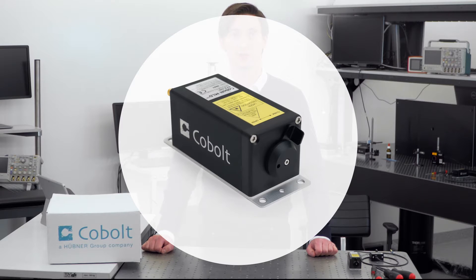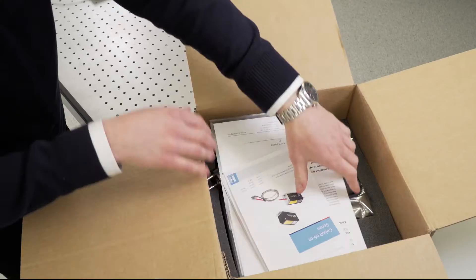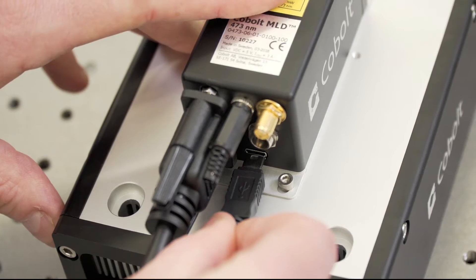Hello, my name is Leonard, and I work at Cobolt as an engineer in the R&D department. In this video, we are going to show you what this type of Cobolt laser looks and feels like, how you assemble it out of the box, and how to interface with the laser.